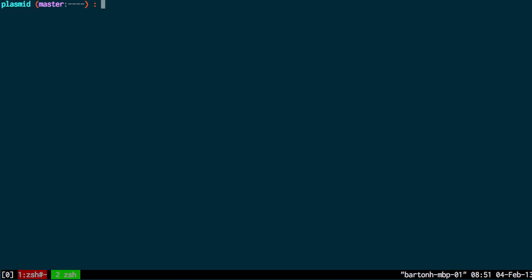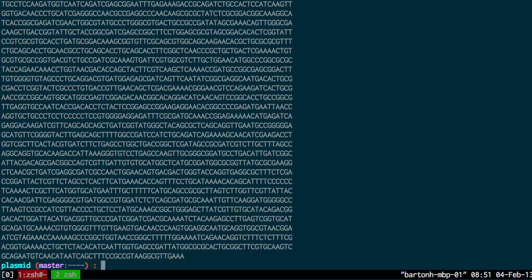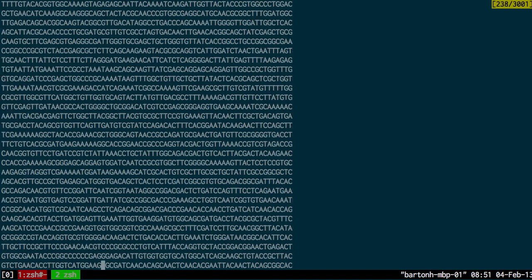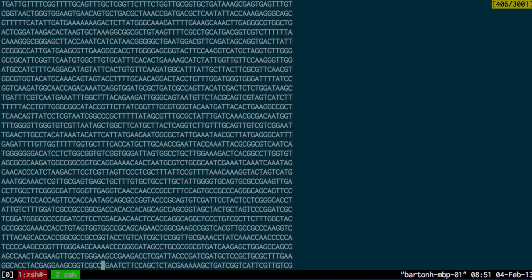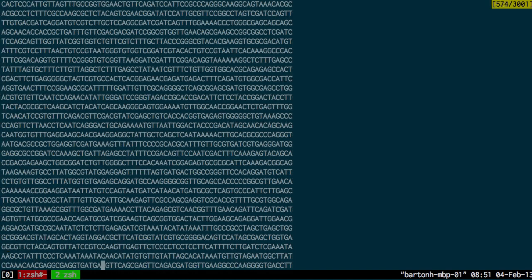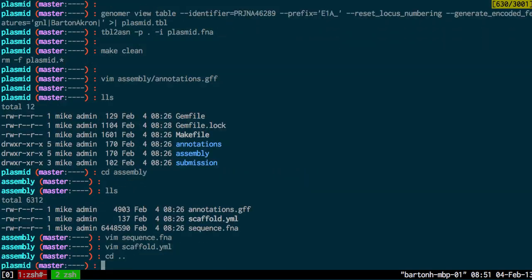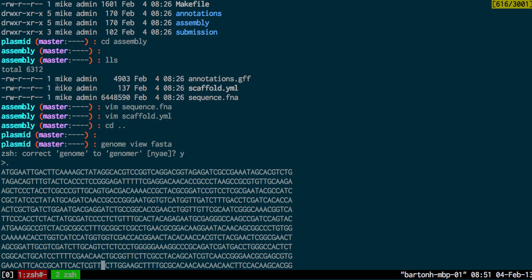So I want to generate the FASTA sequence for that scaffold using genomer view FASTA. You can see here that's the FASTA sequence. I'll just go to the top. You can see it's not particularly useful yet because it doesn't have an identifier.